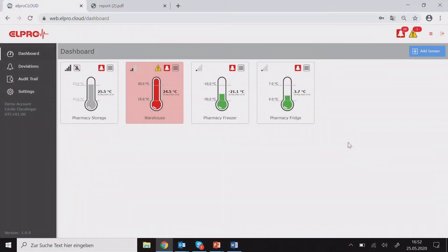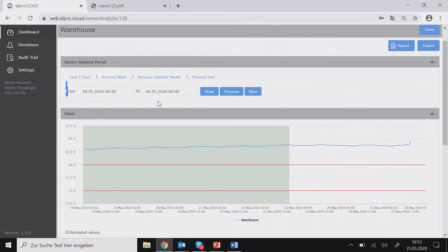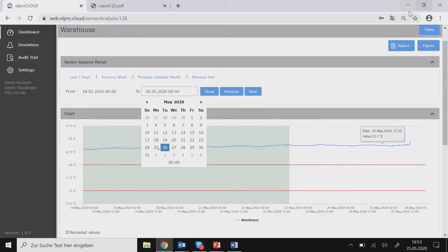In this example you see a dashboard with four sensors. The first one is deactivated. The second one is active and also has an active alarm running — you see this on the red color — and then there are two normal sensors. By double-clicking on one of the tabs you get to the measurement row where you can choose any time period and create reports.